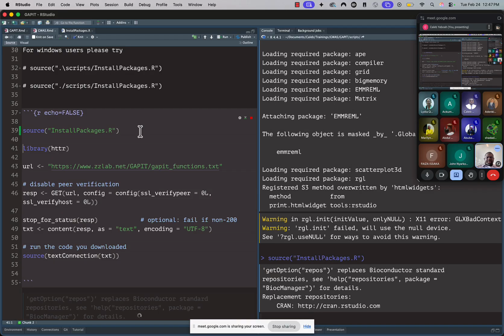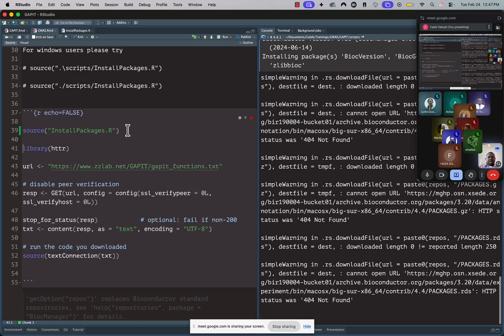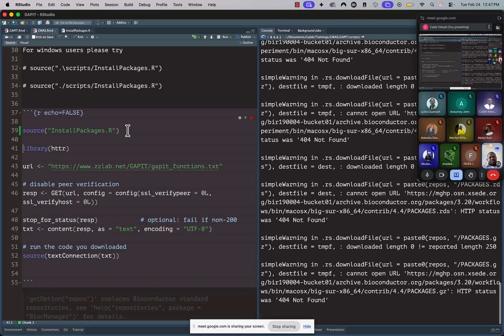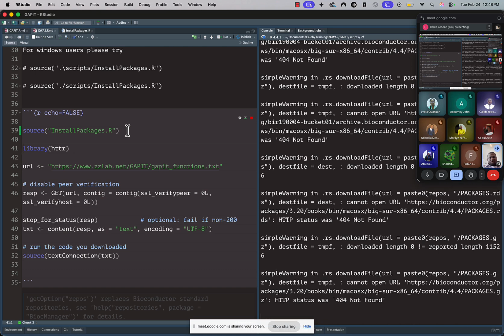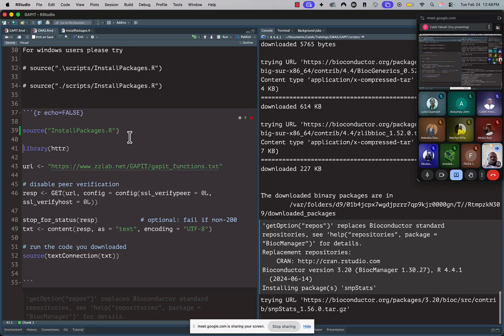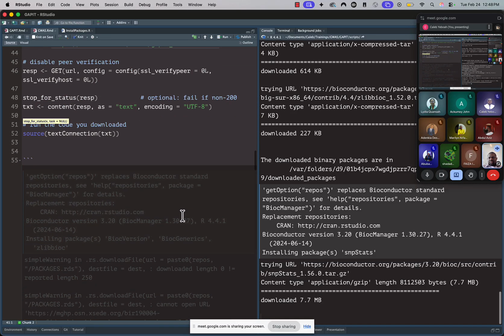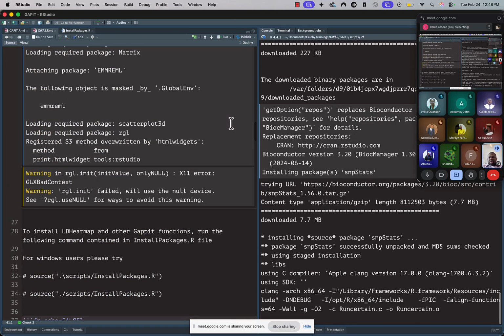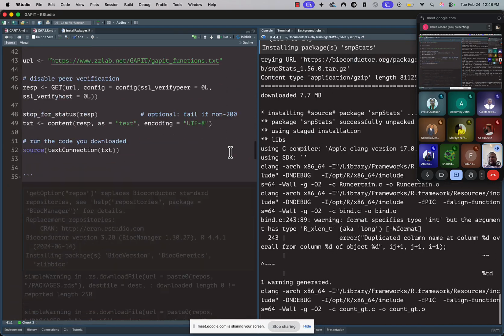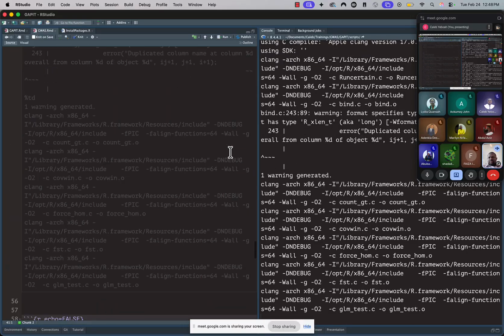If you're on a MacBook, it's Command Enter, but if you're on Windows, it's Control Enter, and then it's going to go ahead and install all of those packages for you. It's doing all of that work to make life a bit easier. Once it's done installing the packages, it's going to take a while.